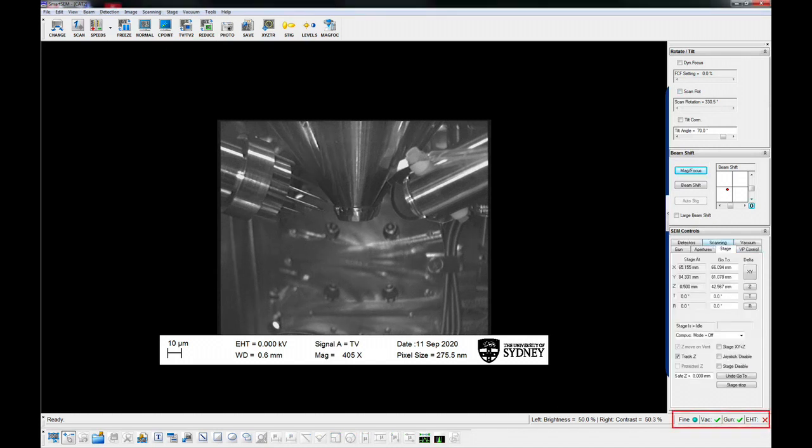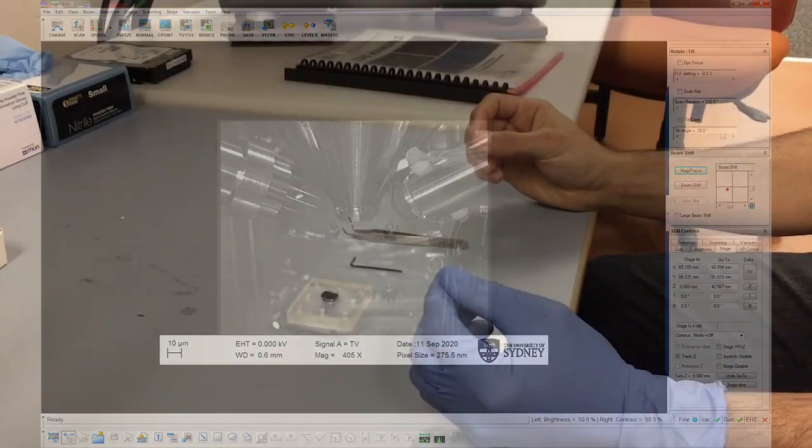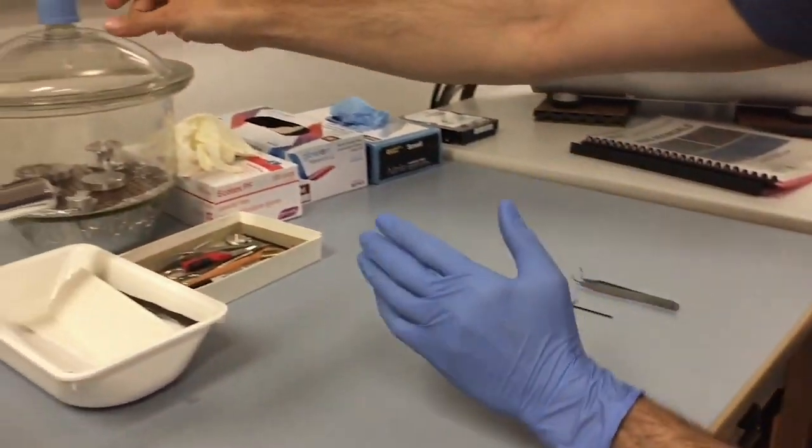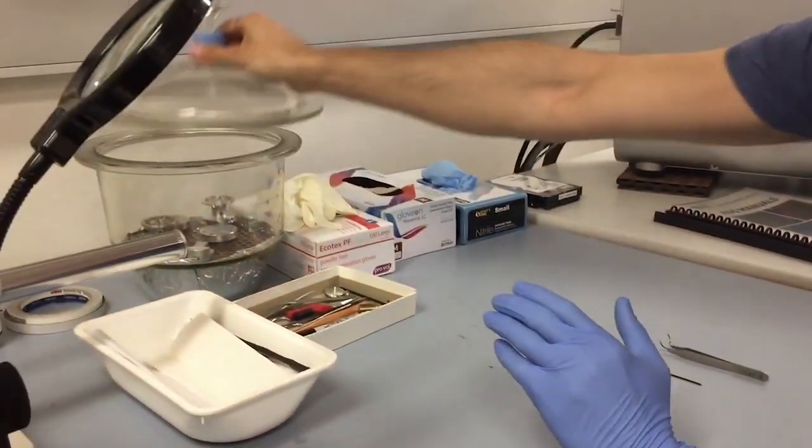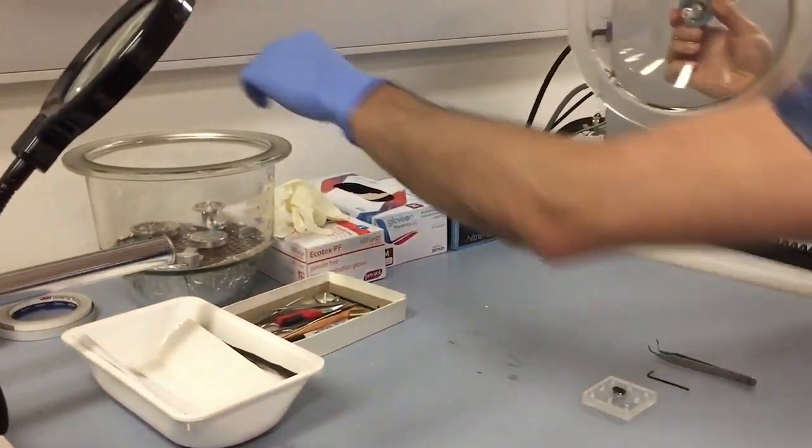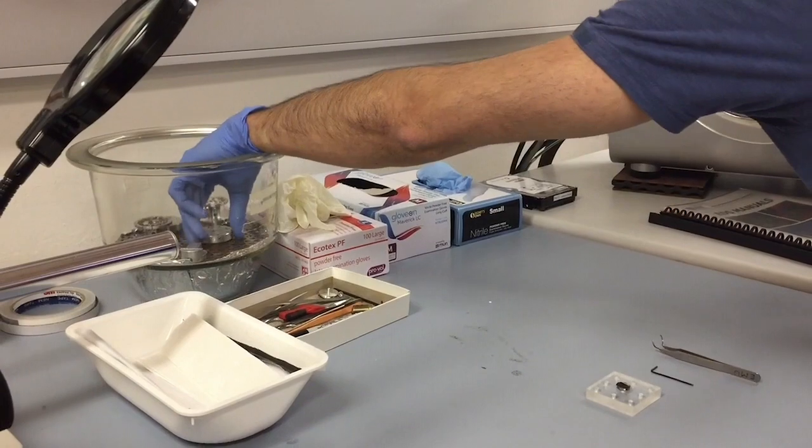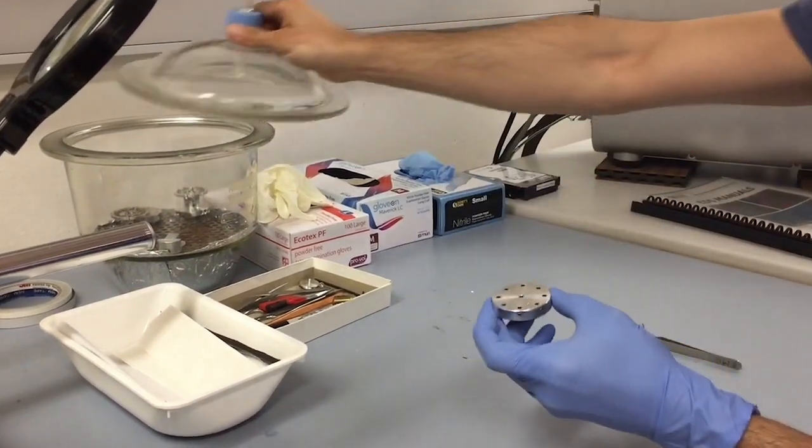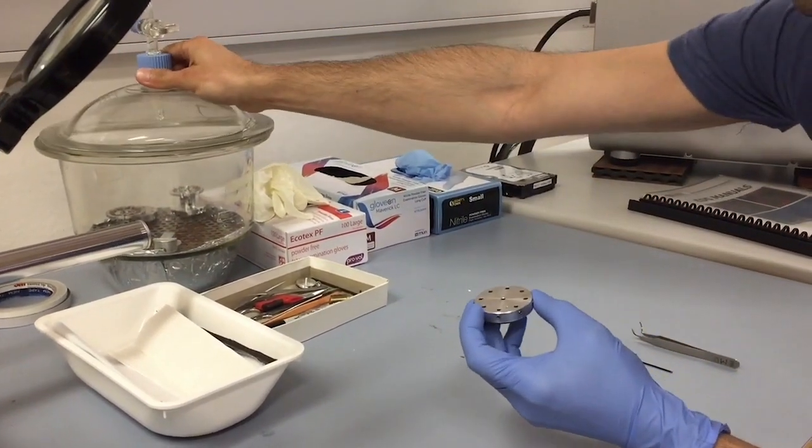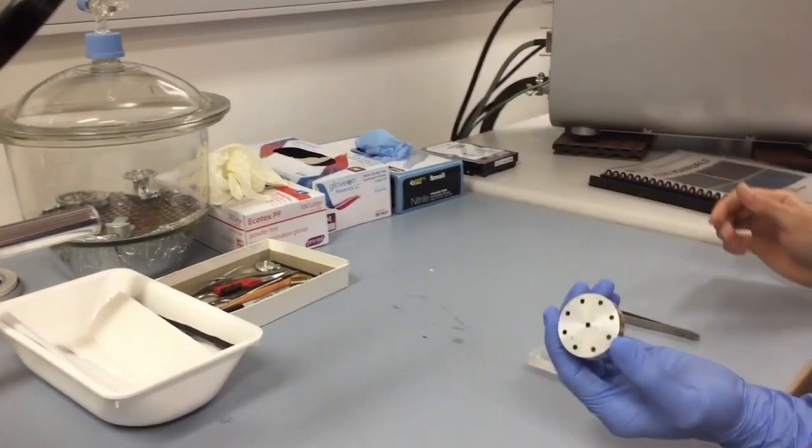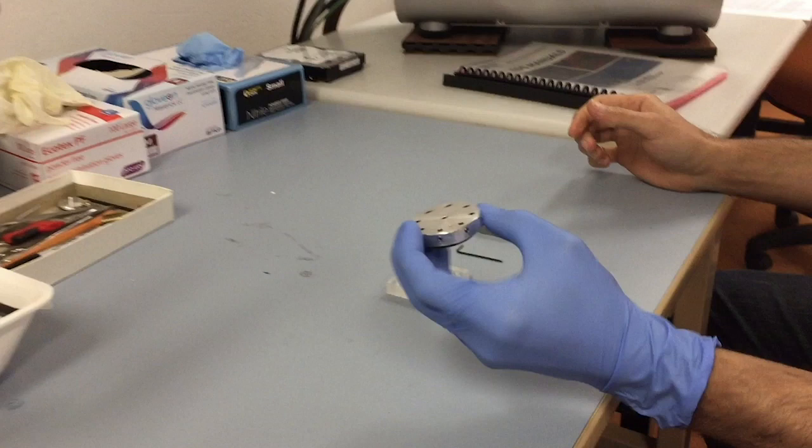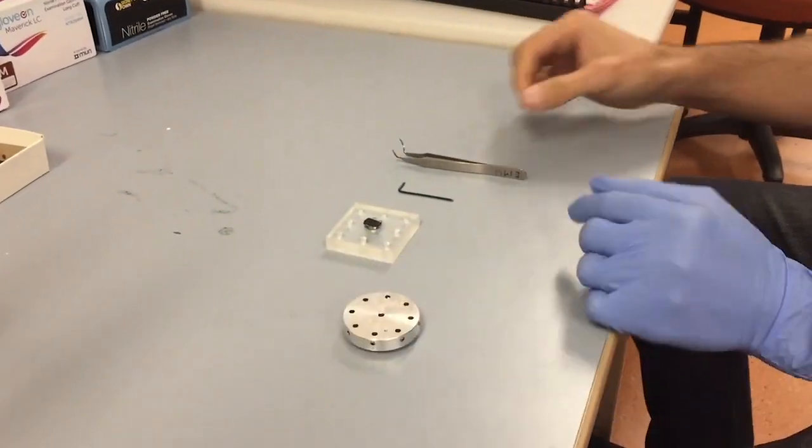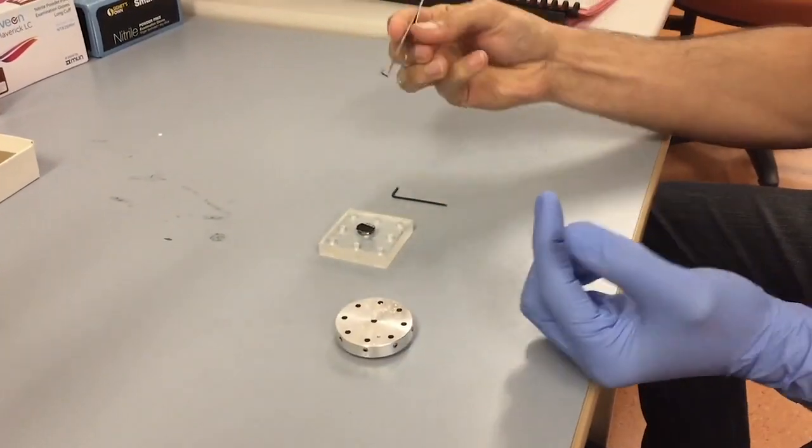Make sure that EHT is off, indicated by a red cross. For pin mounted samples, get the stage mount out of the desiccator, taking note to use your ungloved hand to touch the desiccator cover, tools and computer, and your gloved hand to handle the stage mount and your samples.